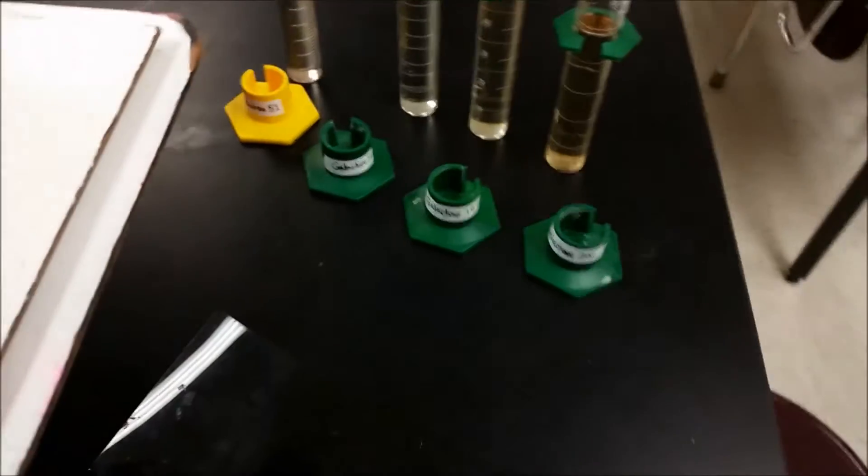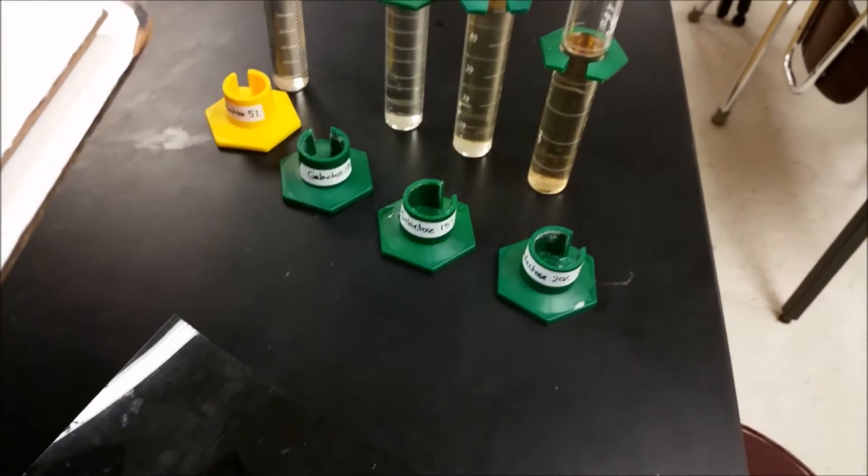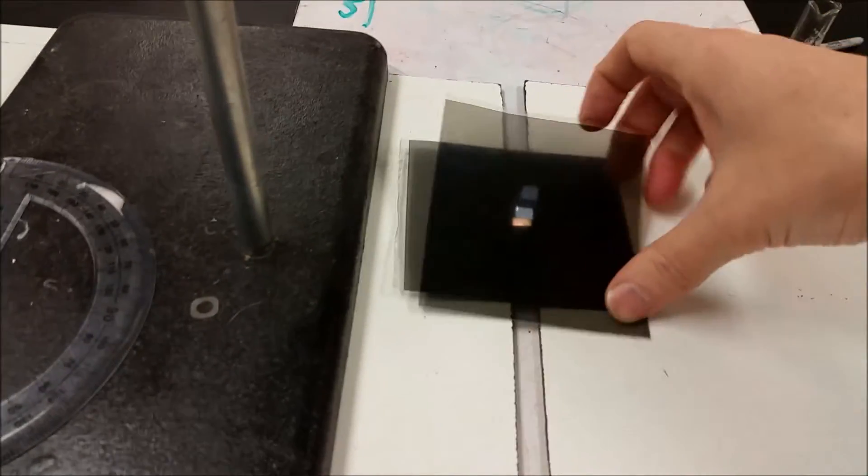So what's going to happen then is as we put our solutions in here from 5% to 10% to 15% to 20%, it's going to change how that light makes it through the second filter.